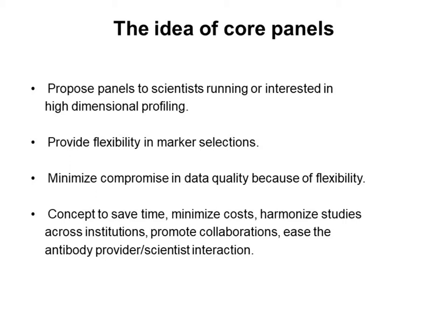Today we'll be focusing mostly on high-parameter panel design, although the same principle applies to maybe less extended panels. The issue with fixed panels such as the OMIPs, although I have to say they are of great scientific and technical quality, is the lack of flexibility.